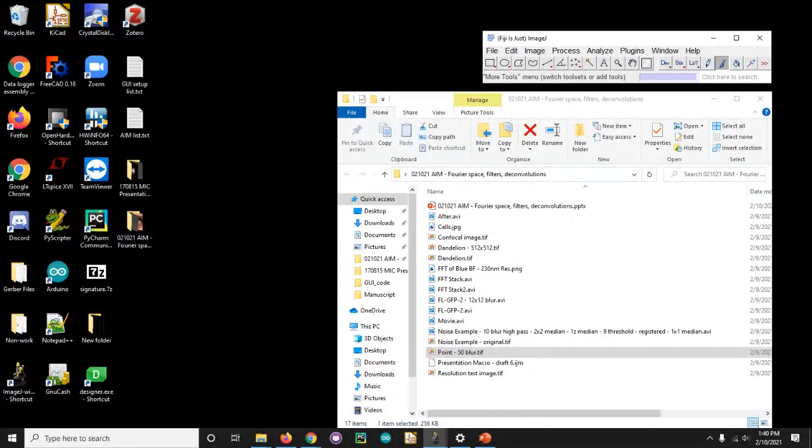So a lot of times in these deconvolution plugins, you can also choose the model fitting algorithms. And on top of that, hopefully the point got across that if you want to deconvolve, say you're also doing an area scan, right? An area scan is a deconvolution.